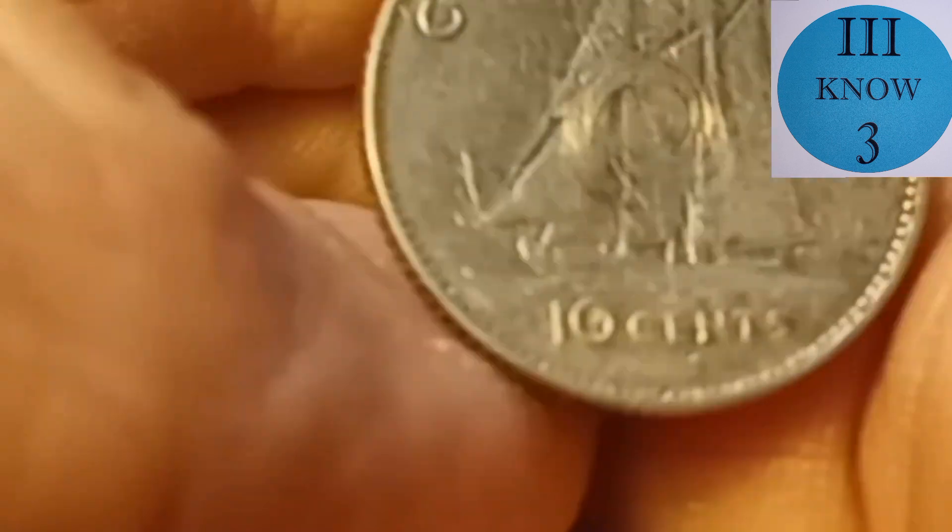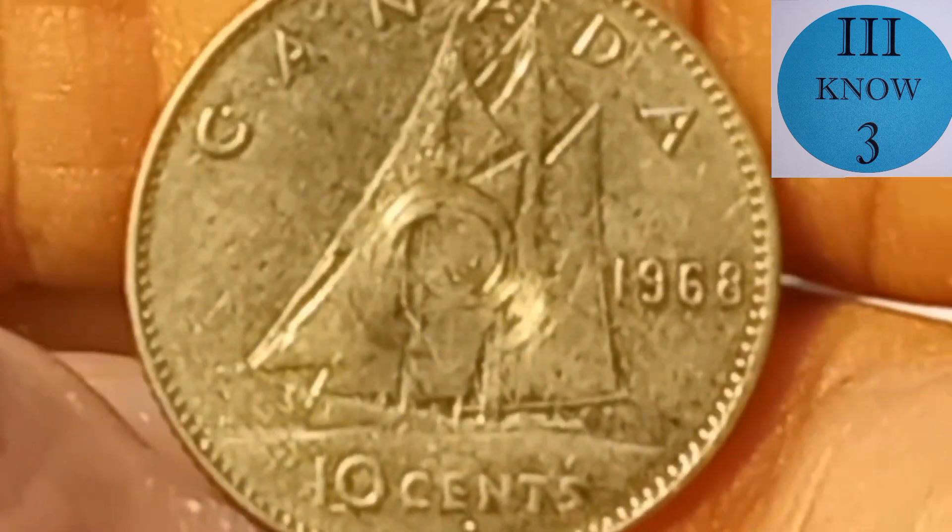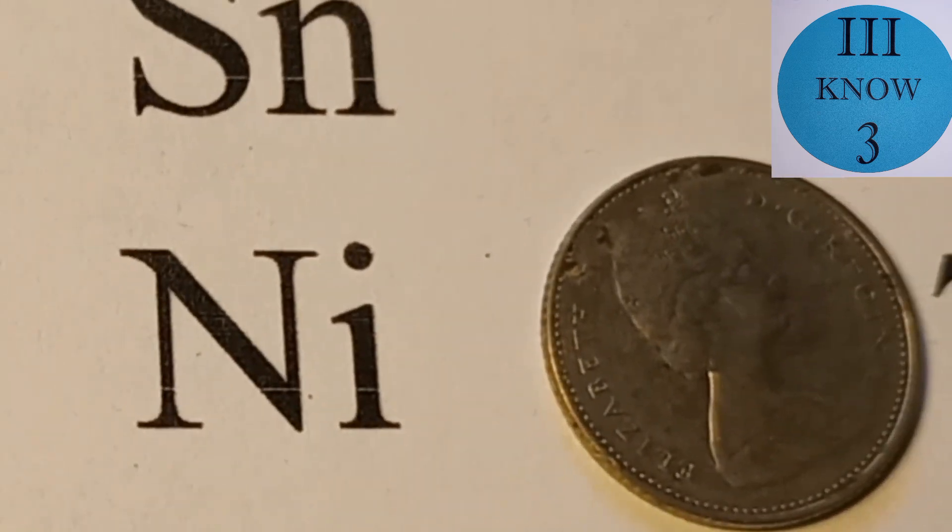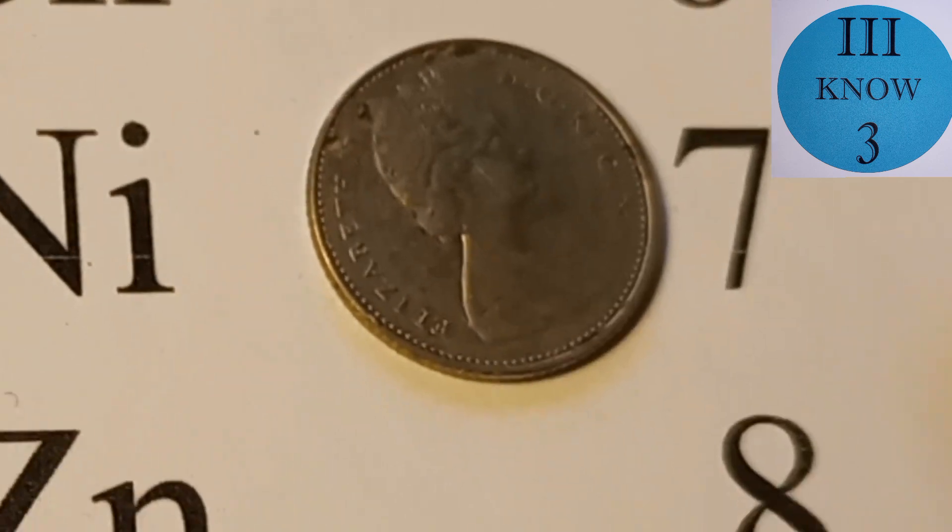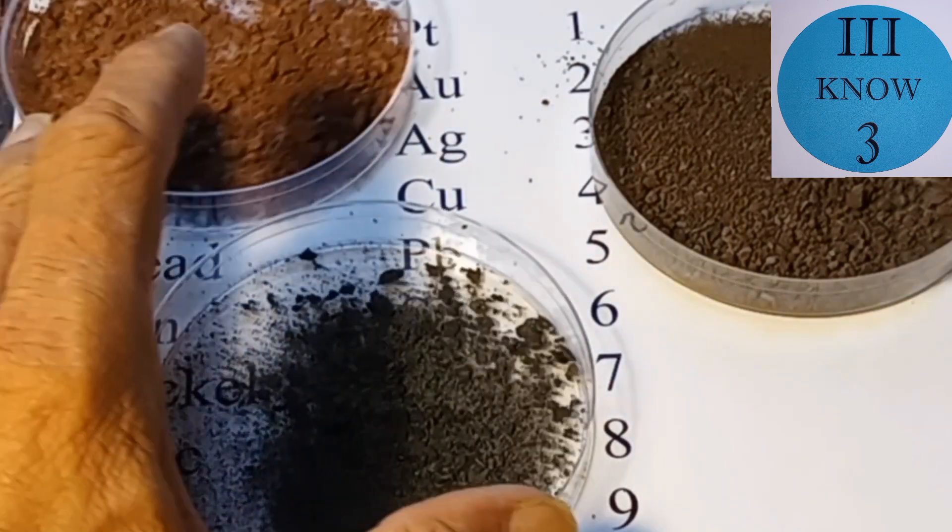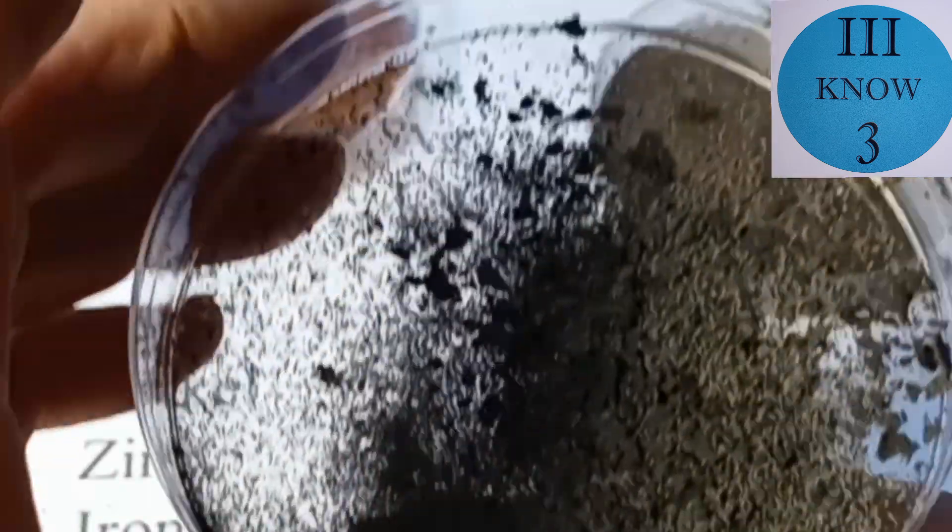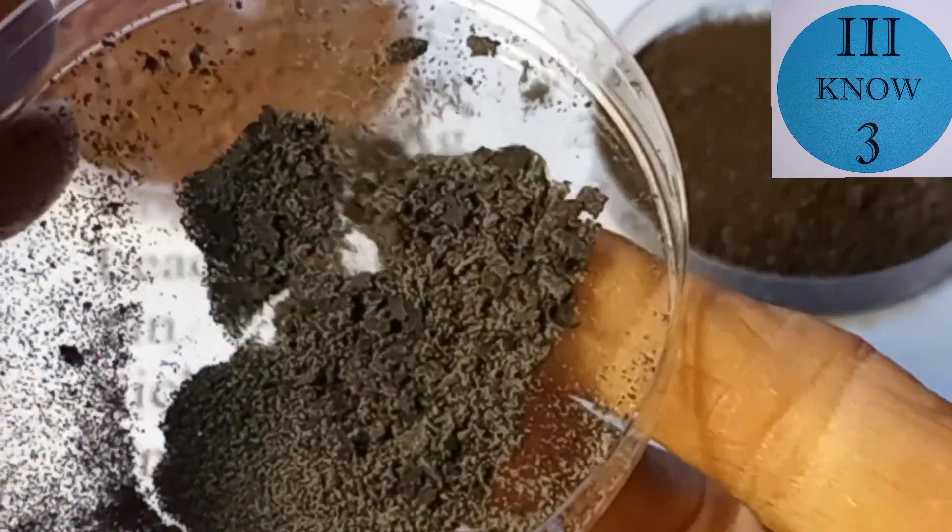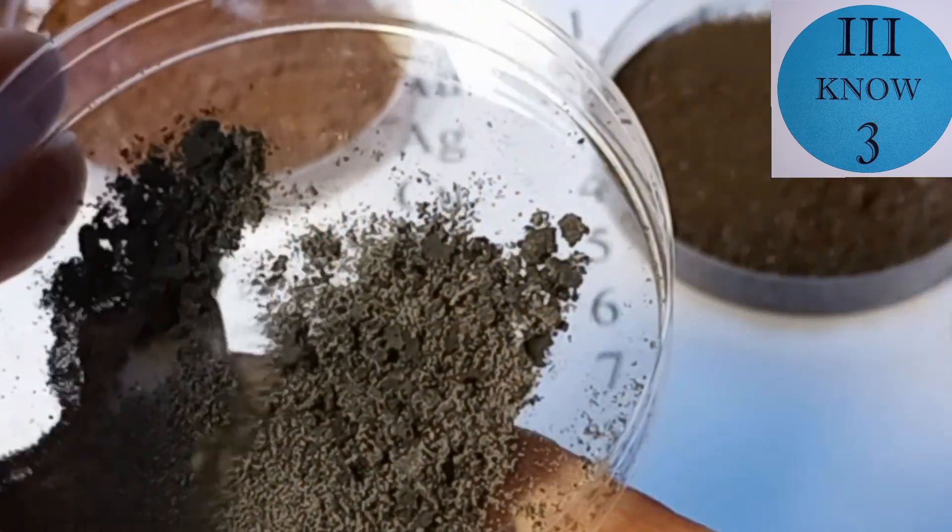Here's a Canadian dime from 1968. Canadian nickels dimes and quarters were made out of nearly pure nickel until 2000. Here's all the metal that we collected in the video. This first sample is the last that we collected that should be pretty pure nickel after all the copper was gone. See how it follows the magnet around.